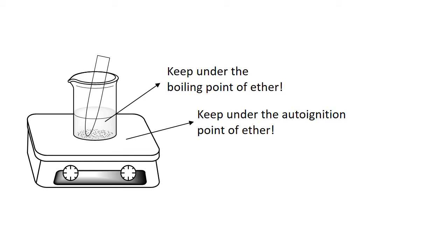You should look up the boiling point of ether as part of your notebook preparation, and you're going to want to keep the water bath below that temperature. You don't want the ether to boil over. You also don't want too much of it to evaporate. We're just using this to dissolve the maleic anhydride.